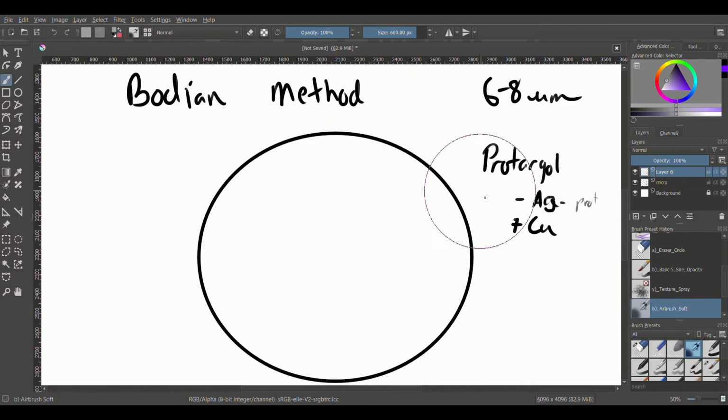In this case, we're going to use an impregnating solution called protargol, which is a silver proteinate, so basically silver, that's going to attach to everything if we didn't add anything to it, which would be a huge mess. Your connective tissue fibers, basement membranes, as well as your nerve fibers would all stain with this.